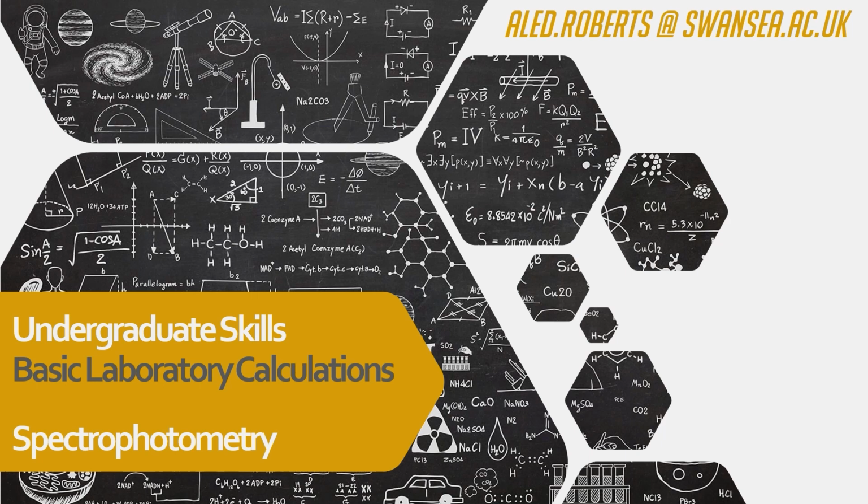Now, why do you need to know about this? Well, it will allow you to perform certain experiments and, more importantly, utilize the various laws that govern spectrophotometry so that you can calculate the concentration of unknown solutions using known samples.